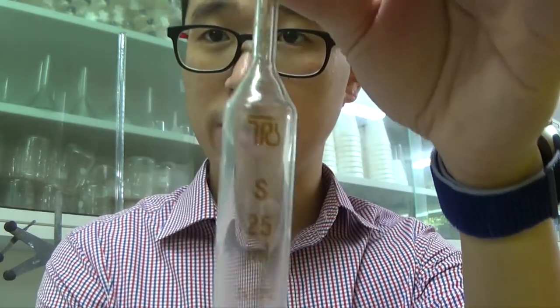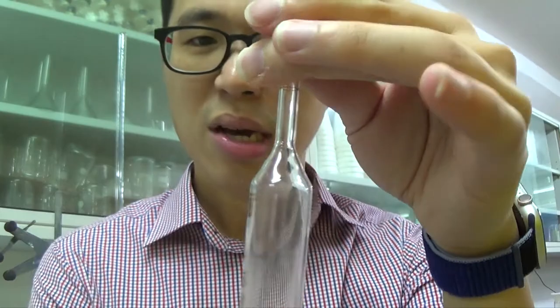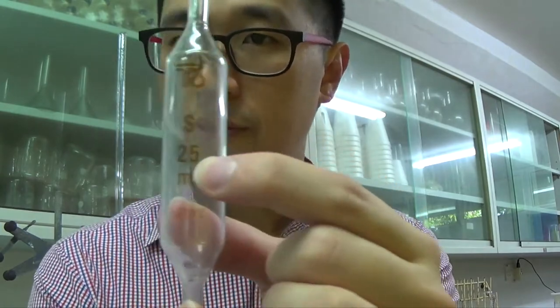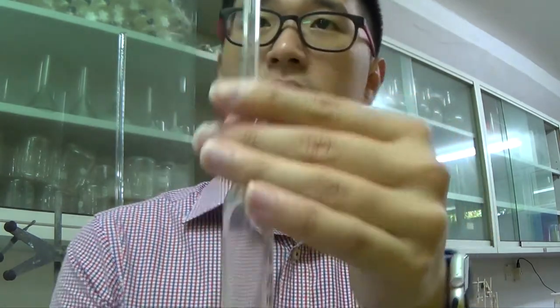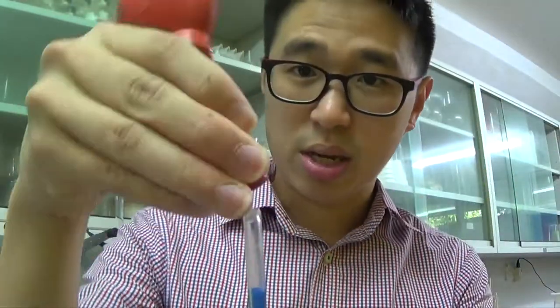A pipette is used to draw out a fixed volume of a solution or a liquid. So it's not as versatile as a burette, but it's almost as accurate as a burette in withdrawing a fixed amount of a liquid. It's got that inlet on the top that we're going to put this in. This is glassware, this is plastic. You want to be careful that you're not breaking the glass. These are very expensive pieces of glassware.